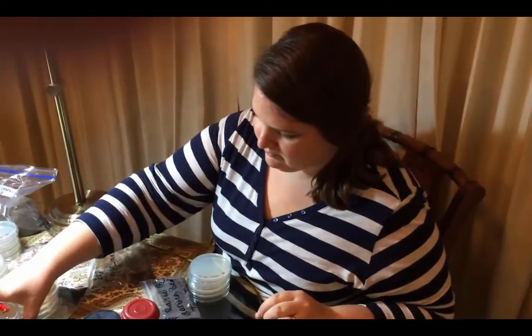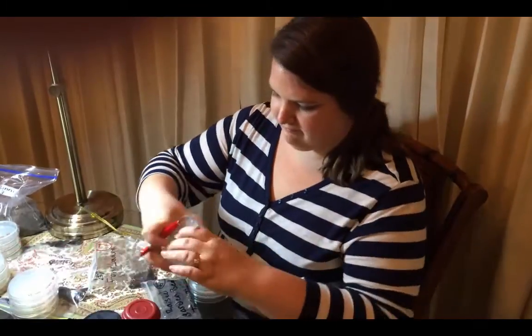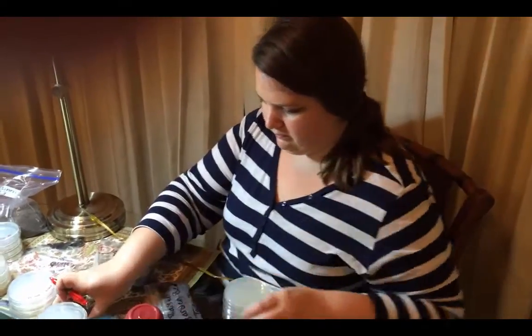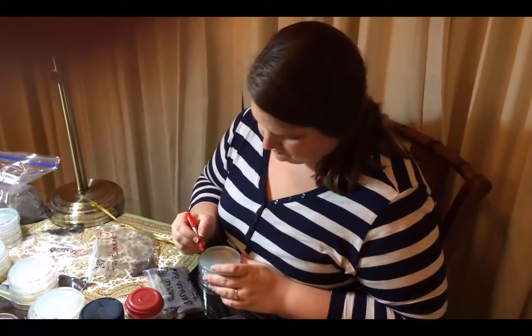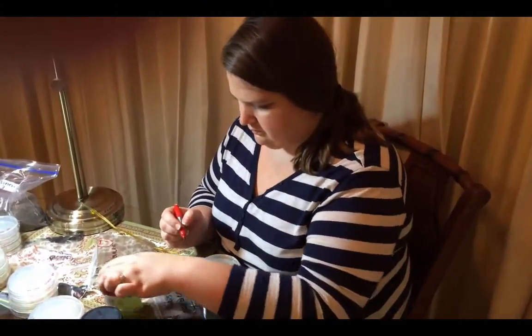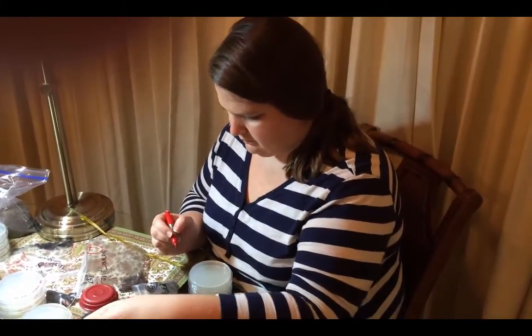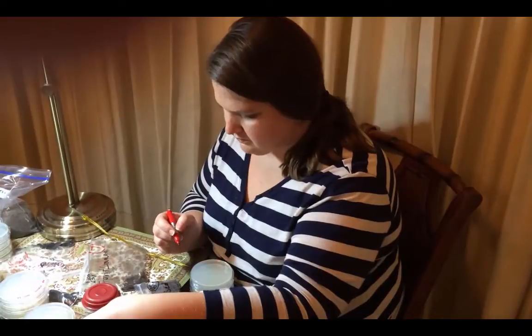Mrs. Birdwell is labeling the plates on the bottom, because the very first thing you do when you do an experiment is get all your plates out and label them on the bottom so that you can carry them upside down so that things don't land on the surface of the agar in the plate. That is good technique.